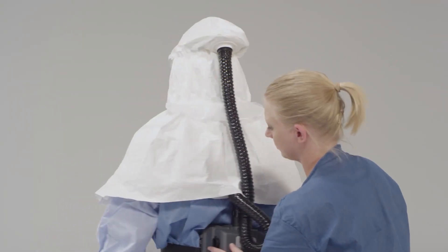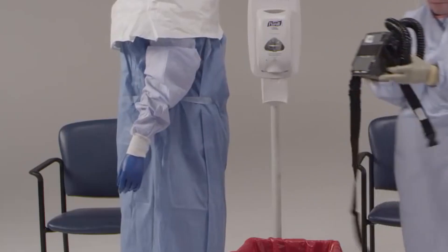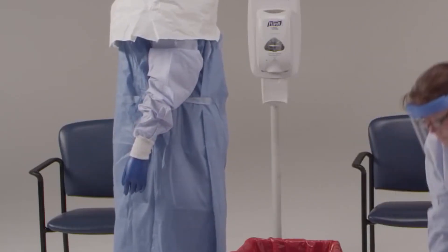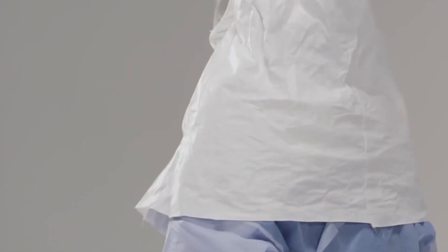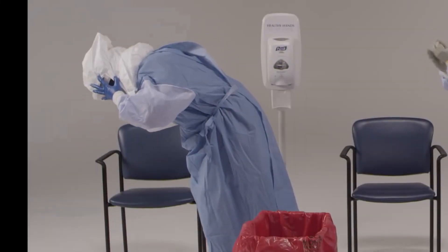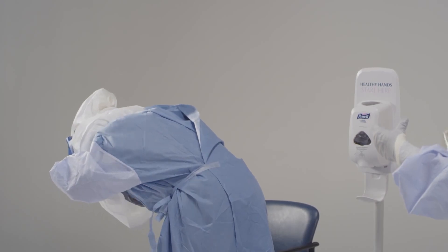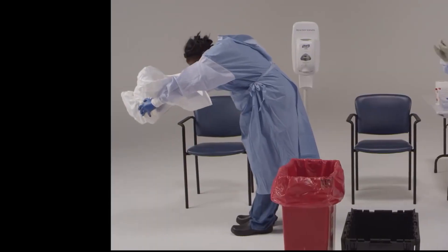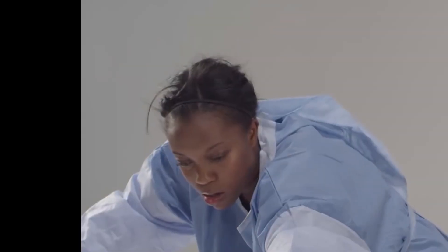Doffing, or taking off, the PAPR. An assistant to the wearer will be assigned. The assistant will wipe the exterior surface of the PAPR while it is still being worn with a disinfectant that is capable of inactivating the contaminants. The PAPR is then removed and cleaned or disinfected outside of the hazard area, within a dedicated decontamination area or anteroom.